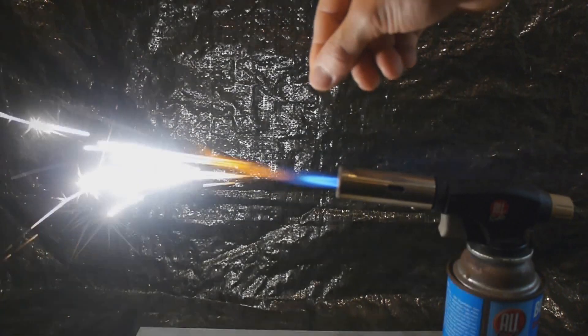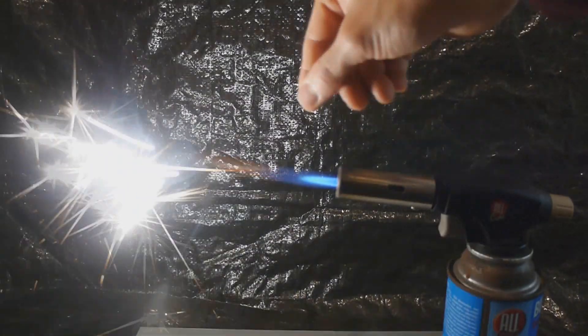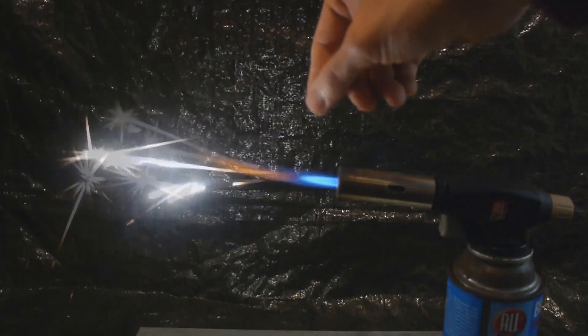To get a feel for how reactive this is, I'm going to take some out and sprinkle it into this flame. And as you can see, it's quite reactive, so we should be able to do some good chemistry with this.